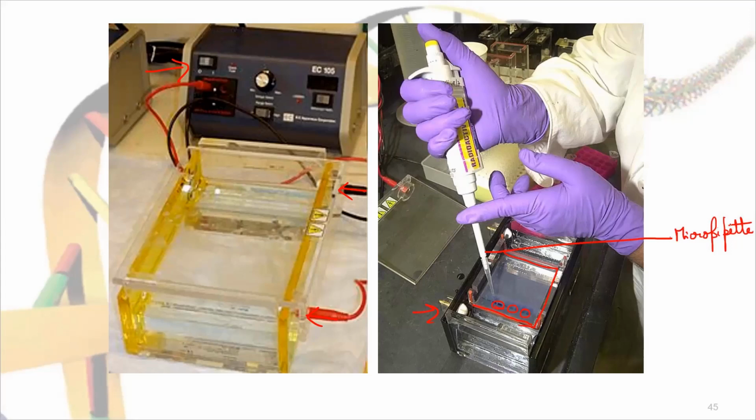A normal pipette you have seen usually has a capacity of a minimum of around 1 ml. This is something which can hold 1 microliter, 2 microliter, like that. Very small amount. So we call it a micro pipette. With the help of this micro pipette, this DNA is being loaded into these small wells which are created in the gel.